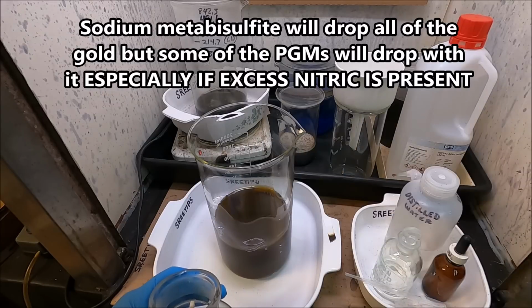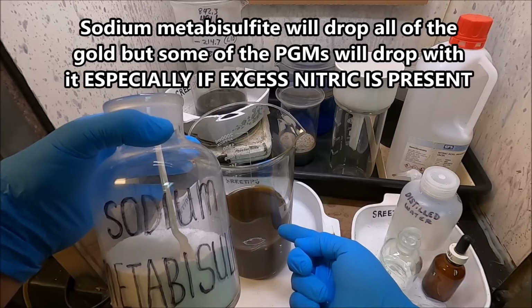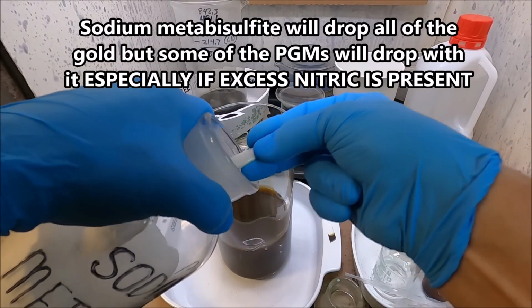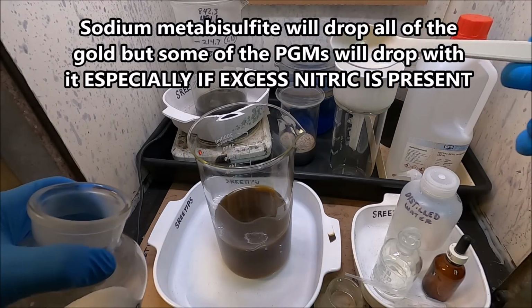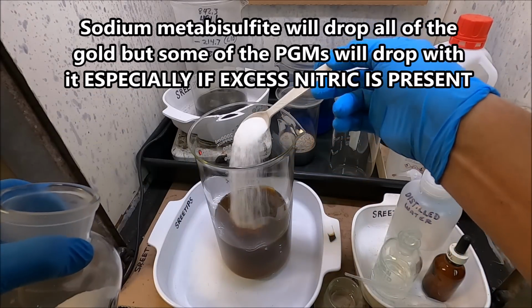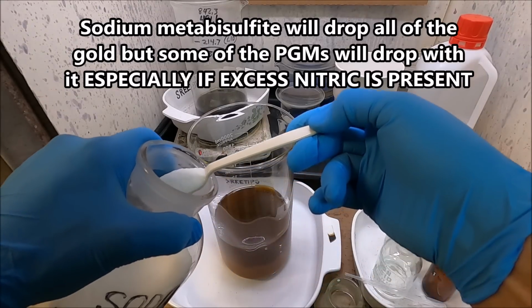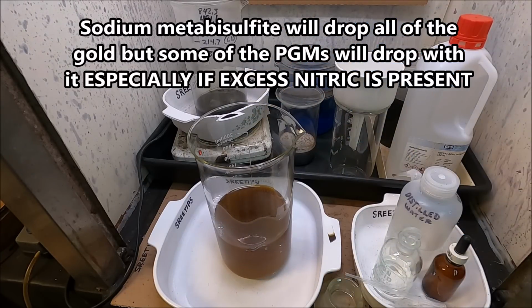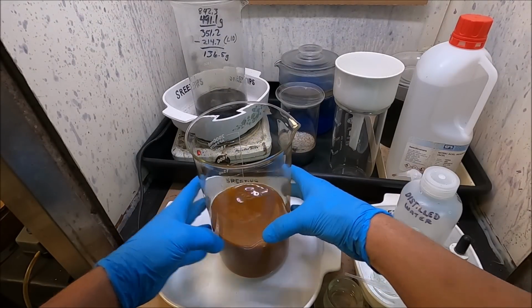What I'm going to do now is add some sodium metabisulfite, and we're going to try to precipitate the gold out of this solution. Now, sodium metabisulfite will precipitate the gold, but it will also precipitate out platinum group metals if they are present in small quantities. So what we're going to get out of this is most of the gold, and we're going to end up with a little bit of platinum group metals left in the solution, with the gold subtracted, hopefully.